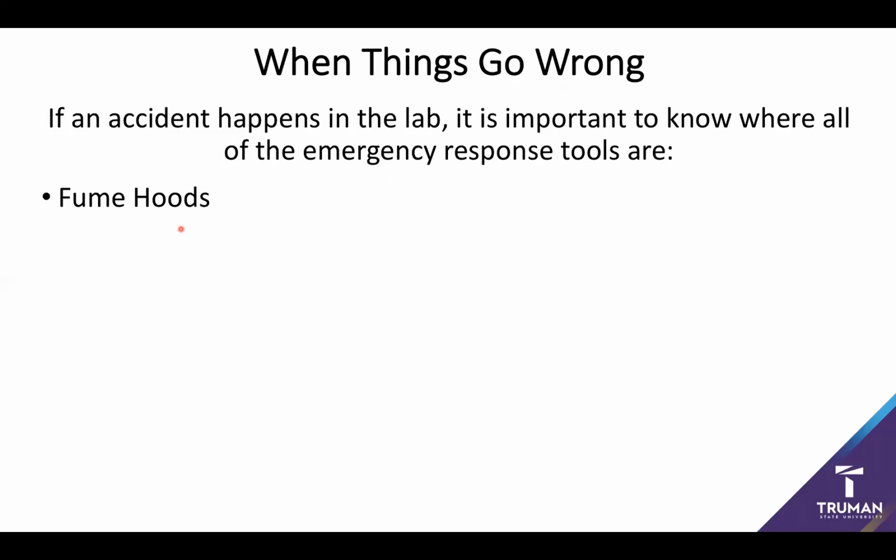as occasionally things can go wrong, such as a reaction that spontaneously starts emitting toxic gas, which I have seen on several occasions. Also, be aware of where all the safety showers are. In case of any sort of chemical exposure or spill on your clothing, you should immediately go into a safety shower and start stripping off your clothes to remove the chemical from your skin as quickly as possible.